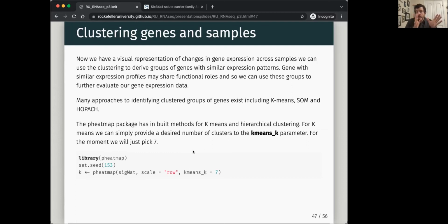So hierarchical clustering works on this idea of dividing, right? So you start at the top and then you divide into two, then you divide those two into two, and then you divide those four into two, so then you have 8. You keep branching out. What k-means does is you're sticking together, and you start off with a centroid and you say which is closest to my centroid, and then you add another one, and then you reassess where the centroid is, and then you add another one, and then you reassess where the centroid is, and you optimize out.